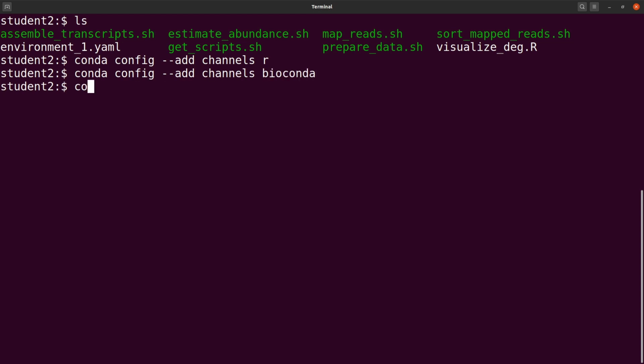Let's add a third one. The same command, but this time we add conda-forge. Perfect. So now we have all the channels added. So we are ready to roll.